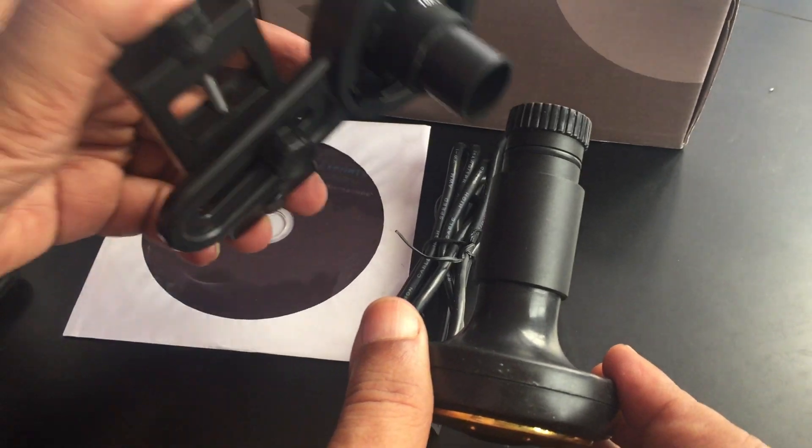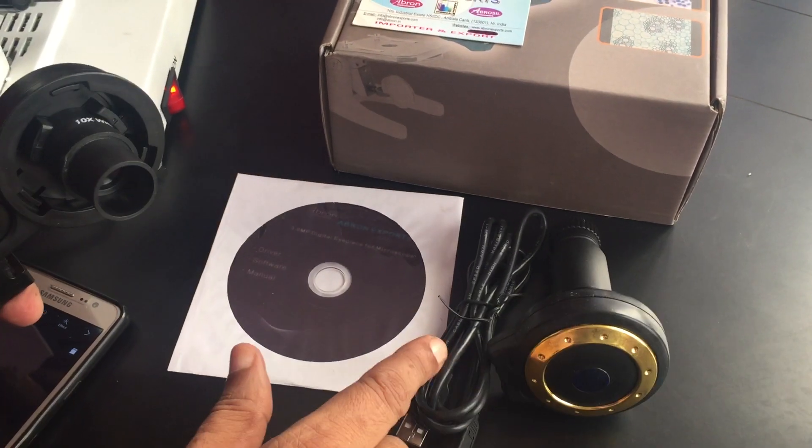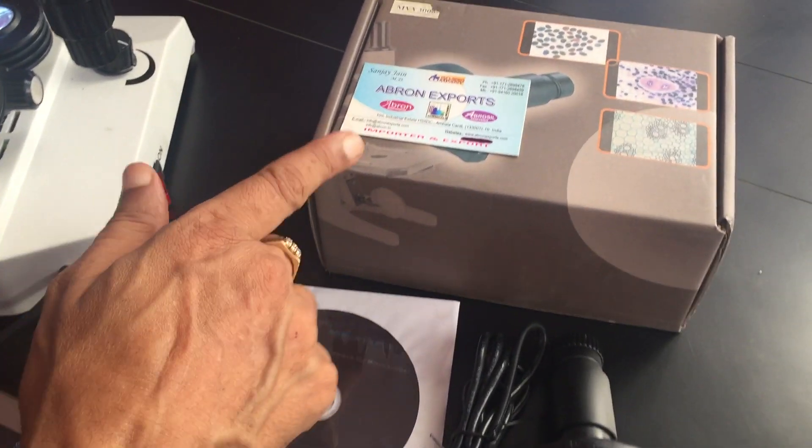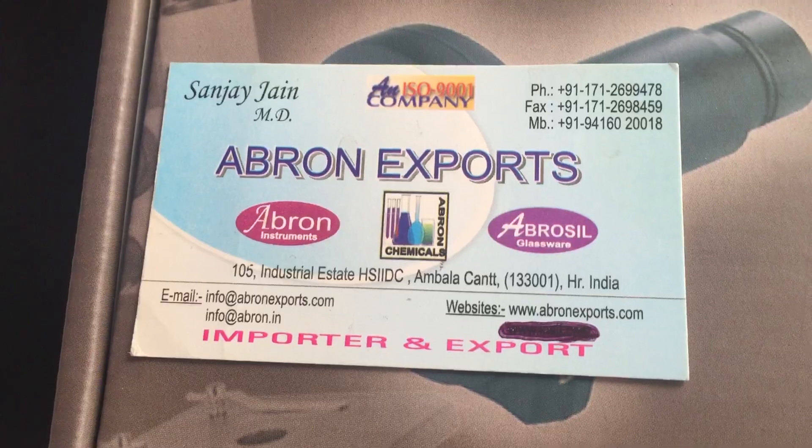These can go directly into an eyepiece — in place of an eyepiece, you can take out the eyepiece and put it there. Wire and software — everything is there. Please visit abronexport.com and see the microscopes.